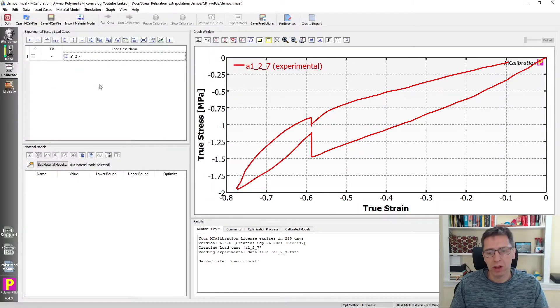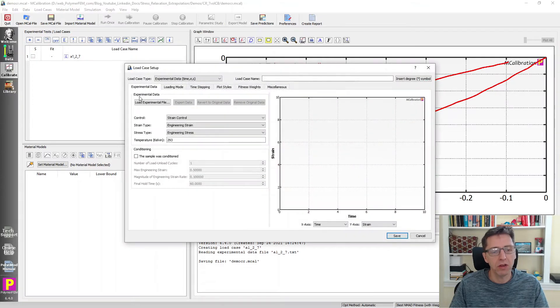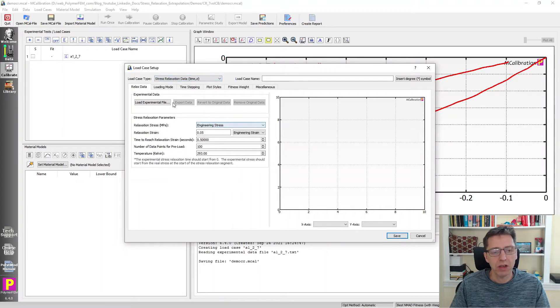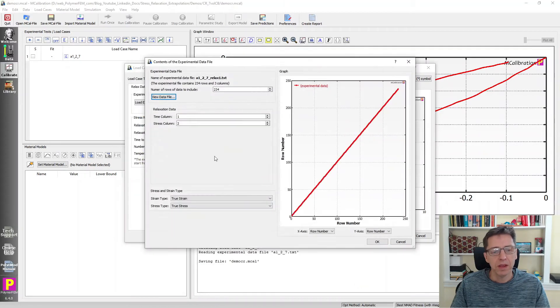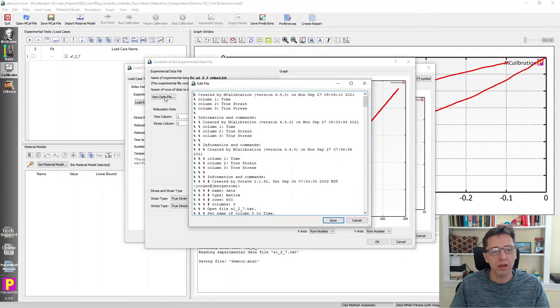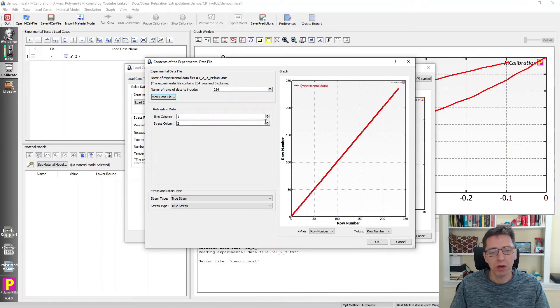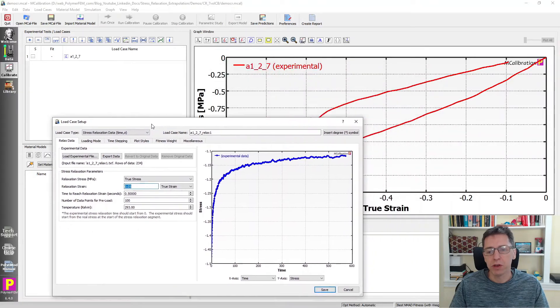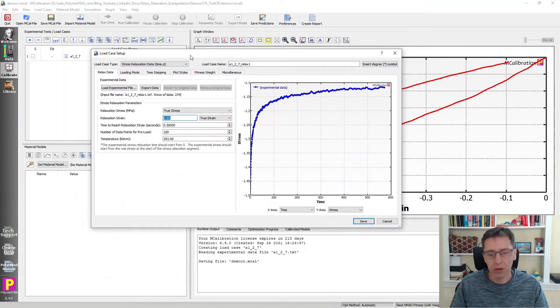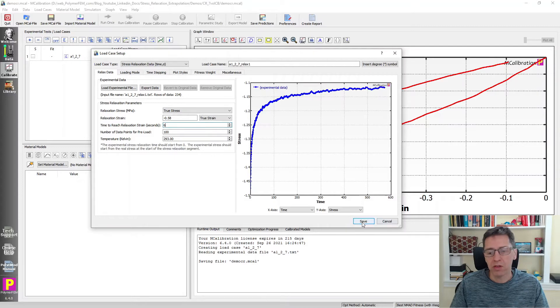Then I'm going to read in my stress relaxation files extracted from the original files — you'll see why shortly. I switch over to stress relaxation and load the first one, relax1. The time column is 1 and the stress column is the third column. It then asks me for the relaxation strain — it's about 58%, so minus 0.58 true strain, and the time to reach that was about six seconds. I save this one.